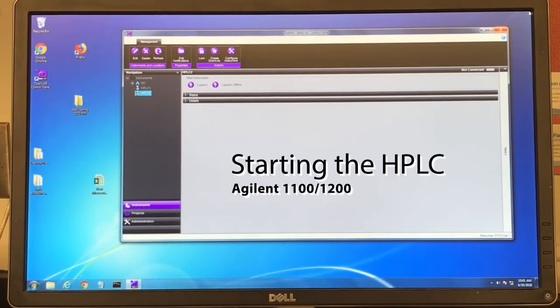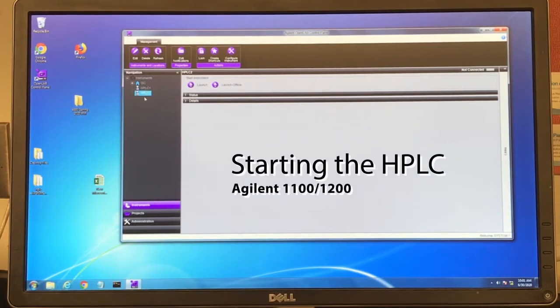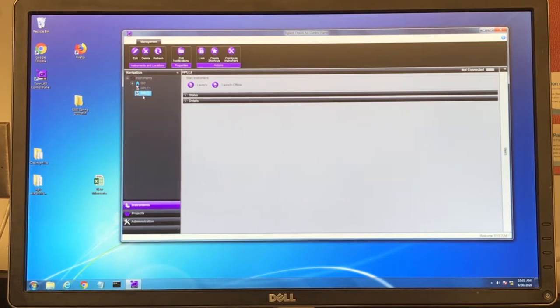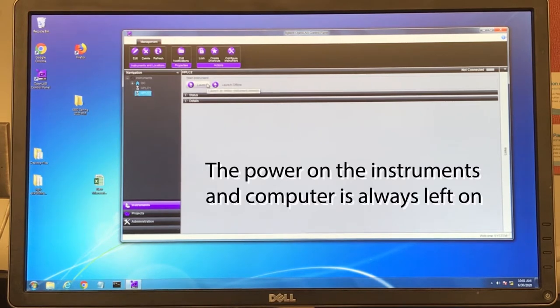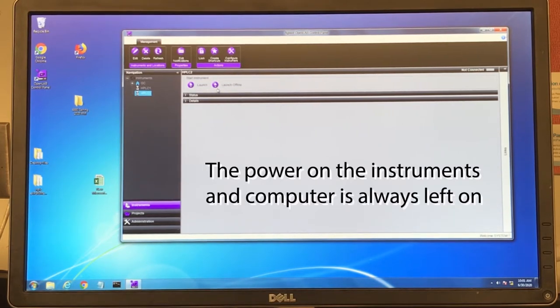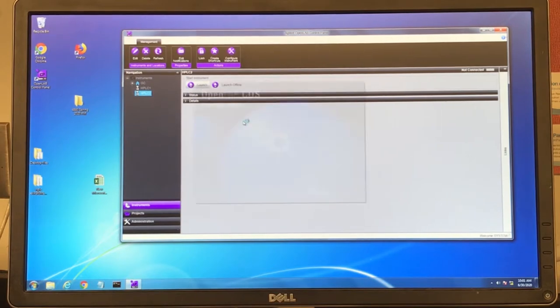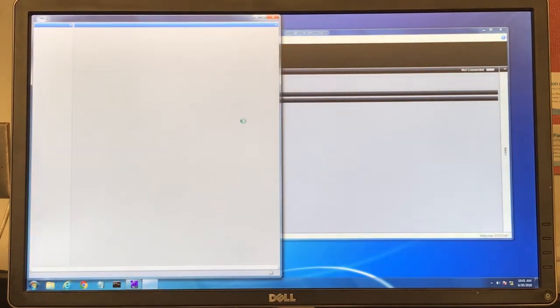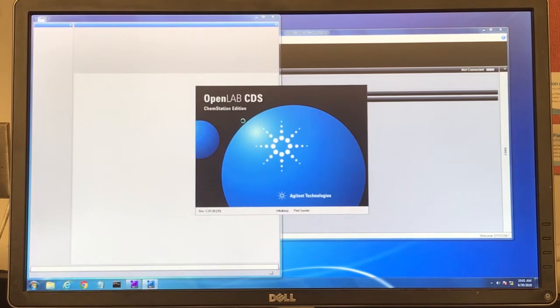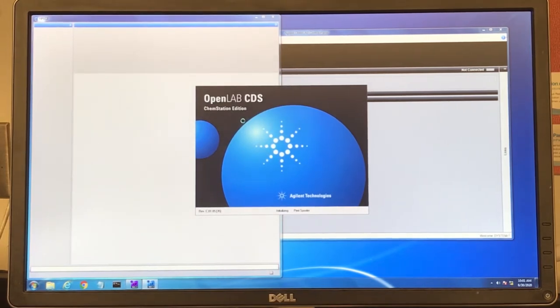To start up the instrument, you select which instrument you'd like here on the navigation panel. We're going to select HPLC2 today, so make sure that's highlighted. You can run both instruments simultaneously, which is convenient. Then you click Launch. OpenLab will open, and then we'll get started with the software and starting the instrument.